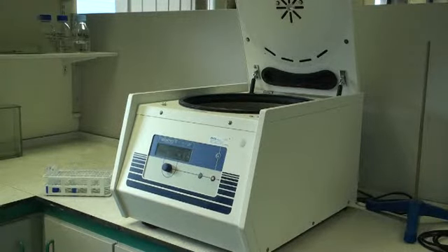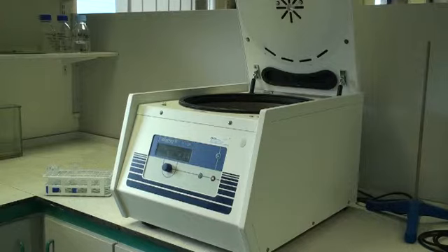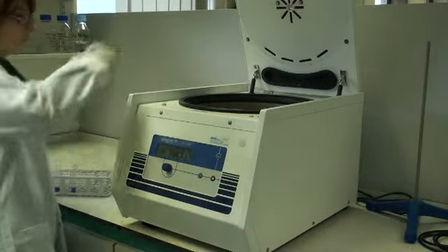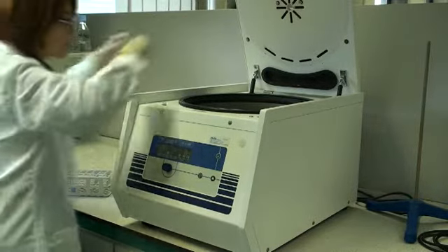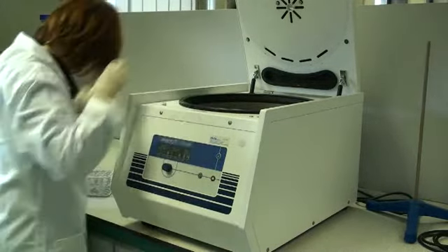After the tubes have been allowed to stand at room temperature for approximately 5 minutes, stir them again on the vortex mixer and then place the tubes into a centrifuge and run the centrifuge for 10 minutes at 3000 RPM or approximately 1800 G.